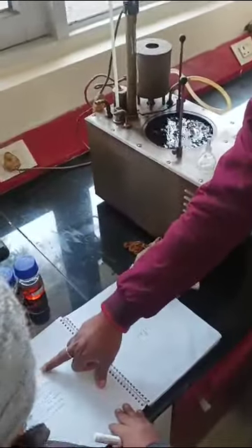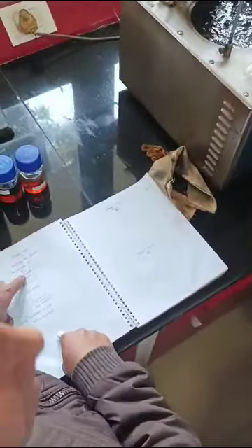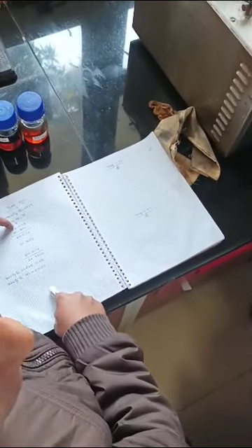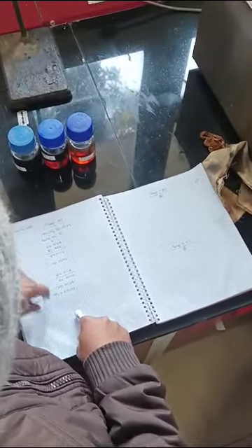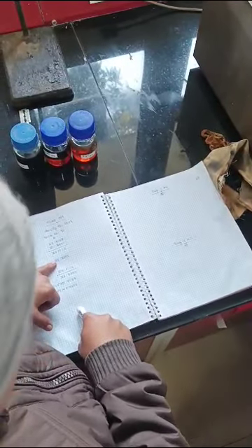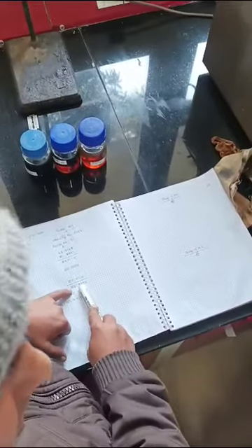Yeah, see, you have already completed one sample. This is 45.9107. This is the weight of the sample plus bottle. Okay, so after subtracting the empty weight of the bottle, this is the weight of the sample. Okay, and I think this is the water equivalent weight. Now, the weight of the sample divided by the water equivalent weight is your density.